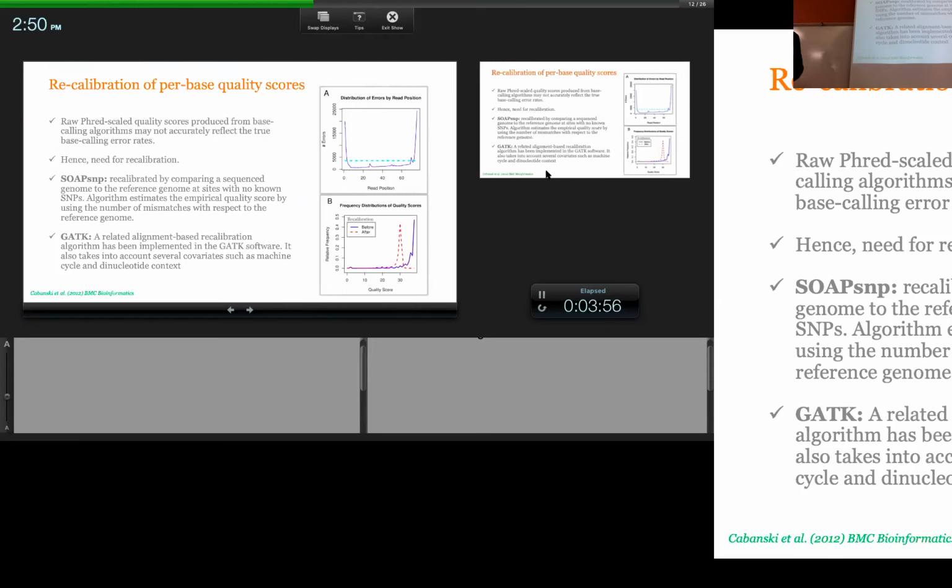Right, so I was saying, if you're penalizing something for being a CCC, what about if the C in the middle is actually a mutation? Right, so I'm just saying that there's a lot of bias that goes into a recalibration correction.